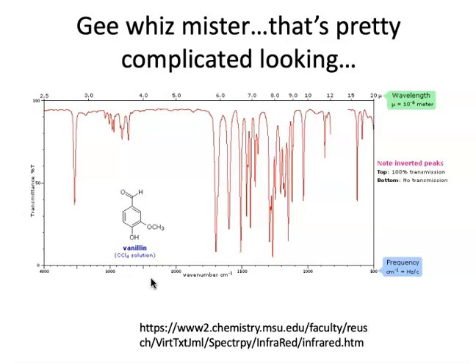But you look at this incredibly complicated set of peaks. The absolute last thing that you should do to these IR spectra is to assign every single one of these peaks, because it will hurt your brains. That is not what I want you to do. That's something that was taught to me, or attempted to be taught to me. And it is just incredibly unuseful unless you are studying exactly what physical principles are going on behind the IR spectrometer, which we don't care about. We just care about the structural information that it gives to us.